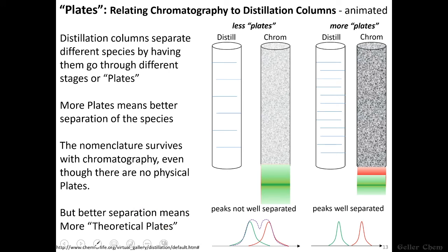And there's a formula for calculating how many theoretical plates a column has. And we're going to learn that formula momentarily. The main thing to keep in mind is the bigger the number we calculate, the better the column is at separating its chemicals from one another. So let's get into that formula. On the left side of the equation, we will write N, and this stands for the number of theoretical plates.